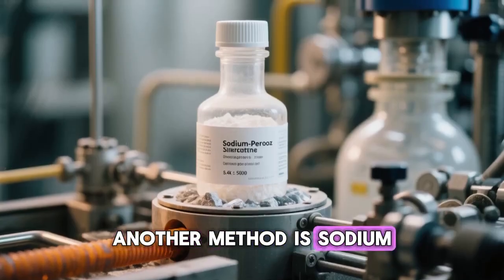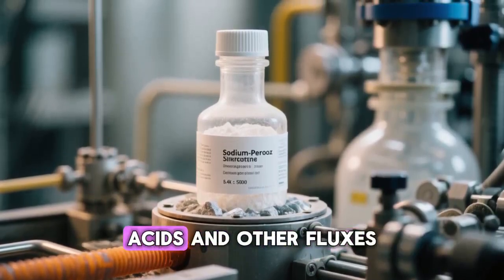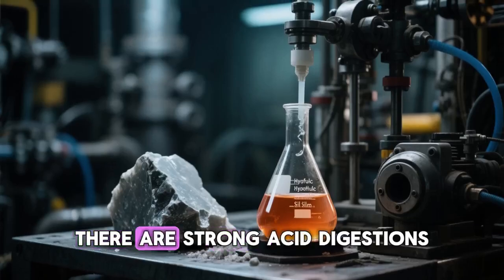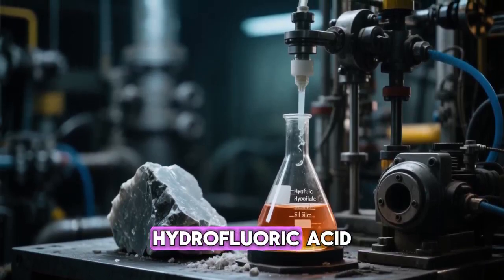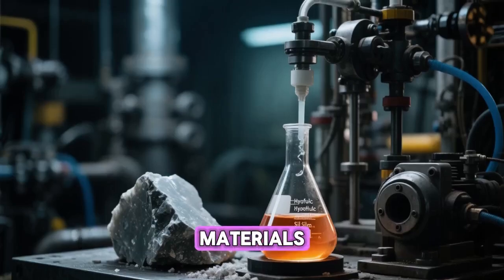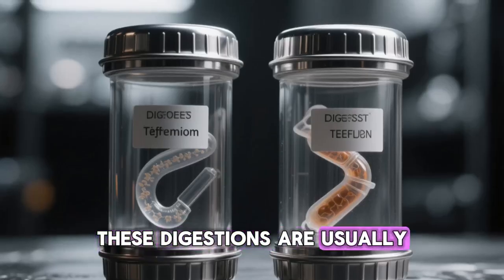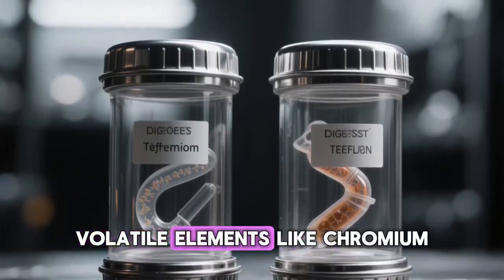Another method is sodium peroxide sinter, which is great for decomposing minerals that resist acids and other fluxes, and it works at lower temperatures, below 500 degrees Celsius. Finally, there are strong acid digestions. These often use a mixture containing hydrofluoric acid, or HF, because it's excellent at dissolving silicate materials. Sulfuric acid is often added because its high boiling point helps remove any leftover fluoride. These digestions are usually done in sealed Teflon containers to make sure we don't lose any volatile elements like chromium.